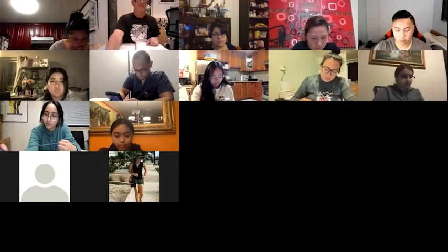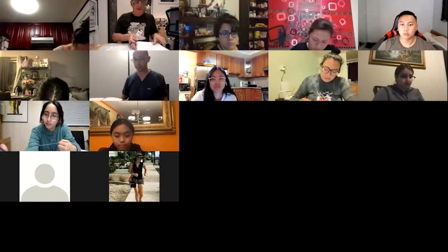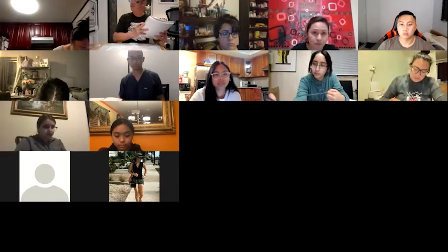All right, let me move my stuff. All right, so you can see my sweet setup here.